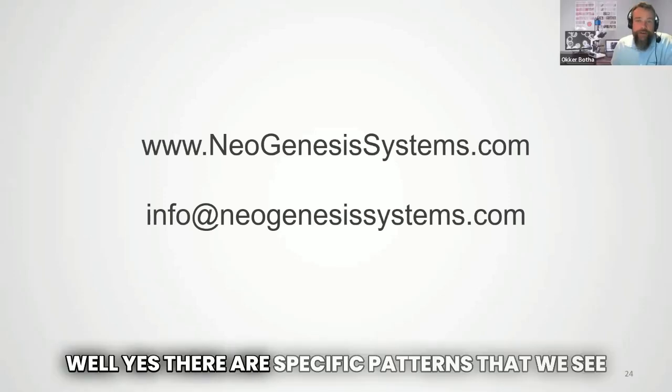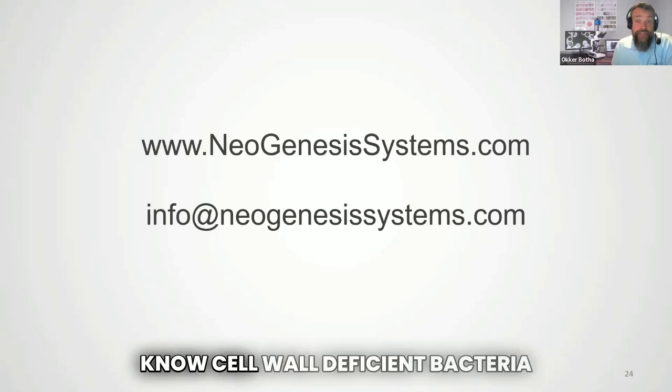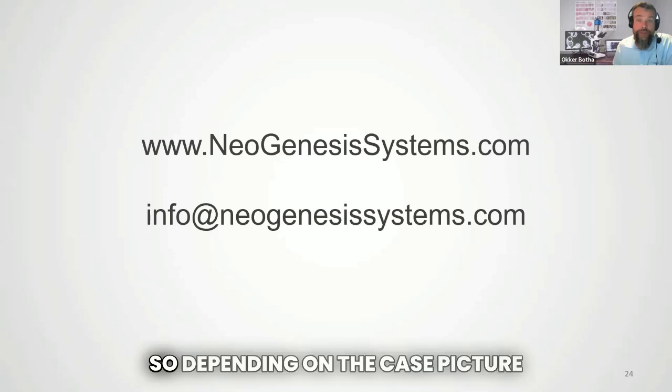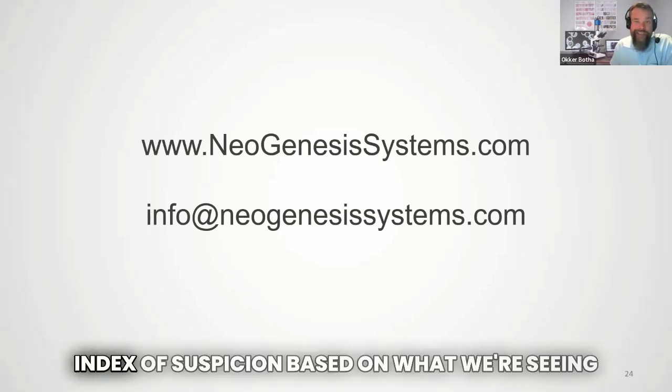Well, yes, there are specific patterns that we see, and although they are not diagnostic of Lyme disease, we can see cell wall deficient bacteria, and those are often linked to Lyme disease. Depending on the case picture, we often work with the case history and an index of suspicion based on what we're seeing.